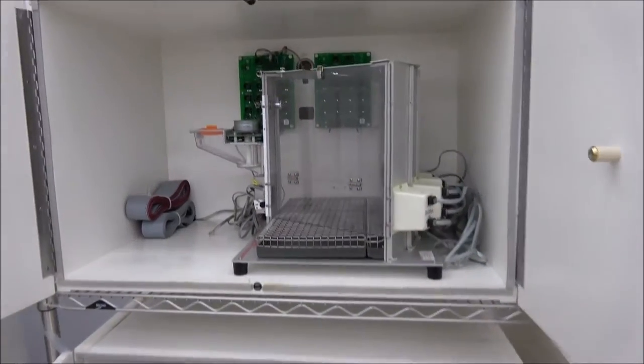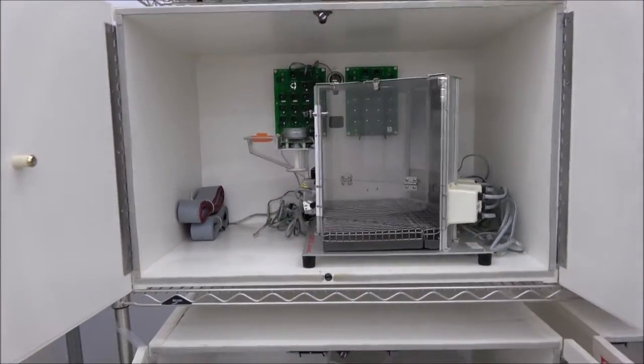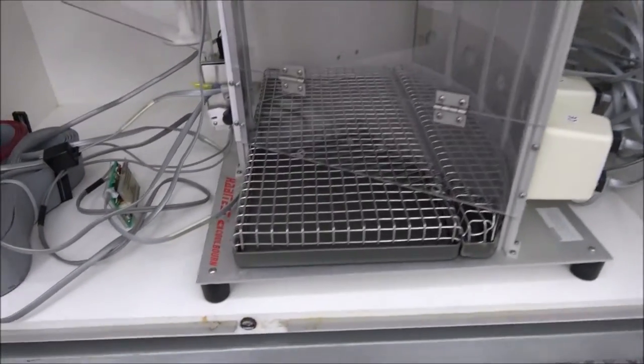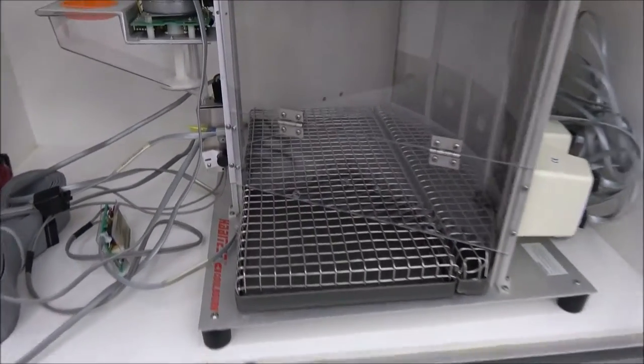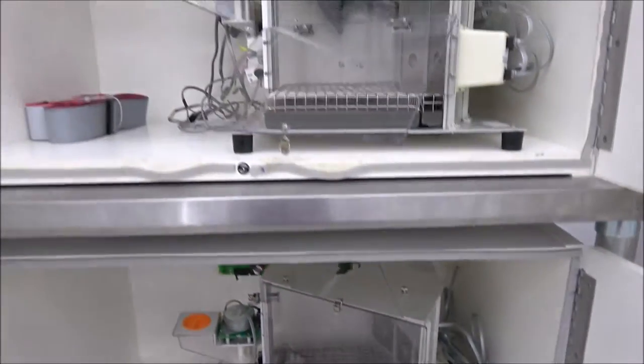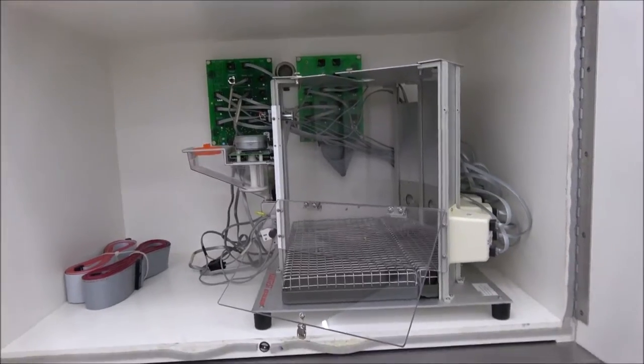One nice thing about this system: it is capable of handling rats or mice, and you can tell by the grids on the floor there that would accommodate either one. That makes it nice. Here's the last chamber—this is the one I've got the window open on.